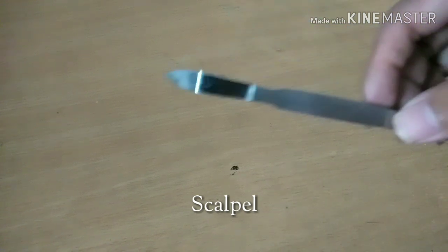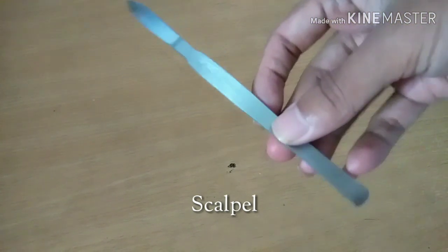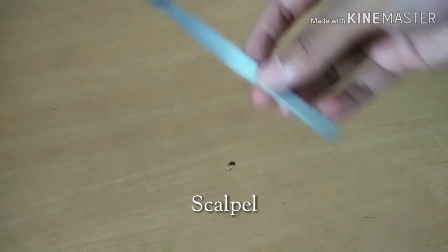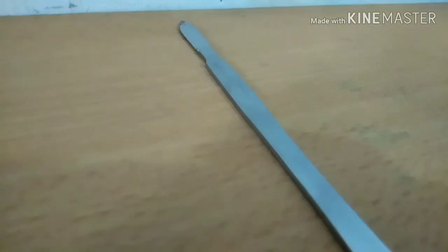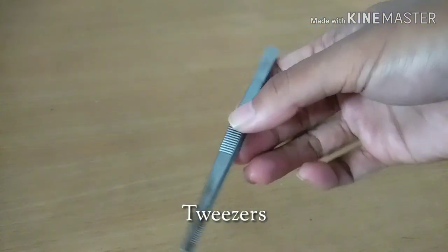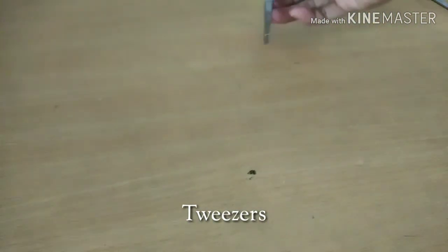Scalpel, to scrape onion membrane. Three, tweezers have a function to take an internal membrane of onion.